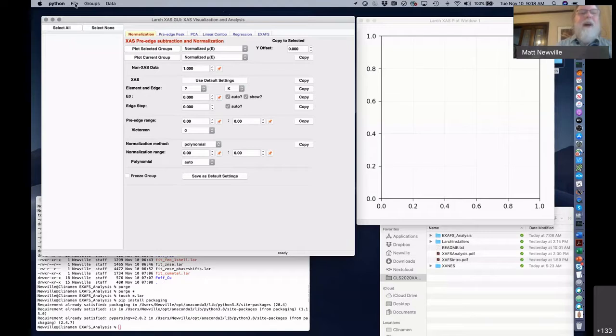Okay, just a thing before you start the next session. There are a couple more questions. Maybe one of them is more related to this, so I'm going to ask here. The question is, in XANES, when can I consider the photoelectron is in fact ejected from the atom instead of being promoted to unoccupied states?